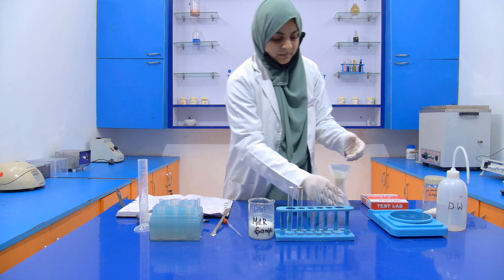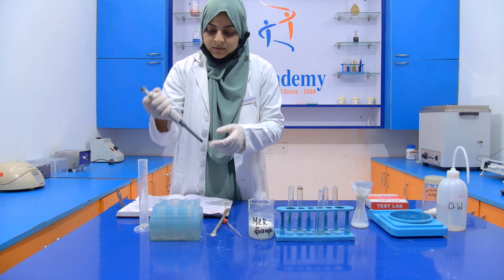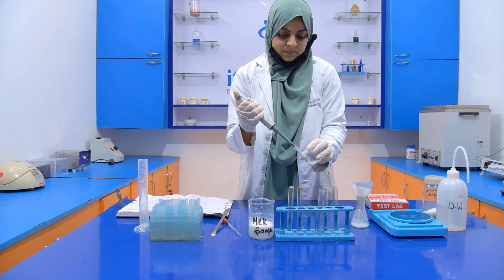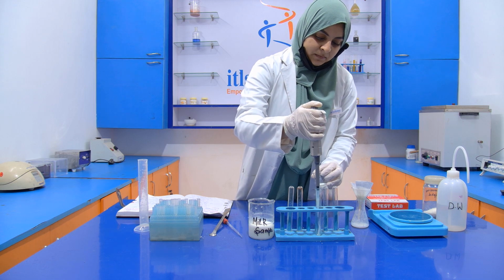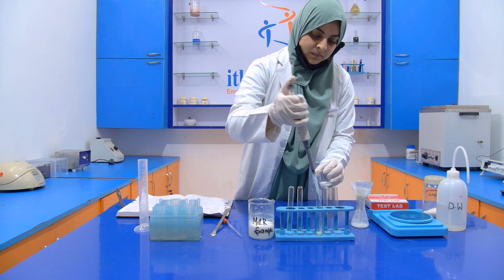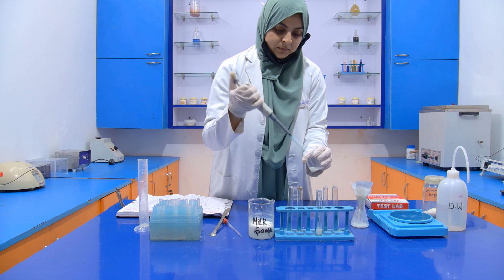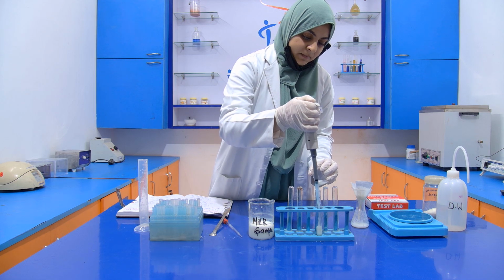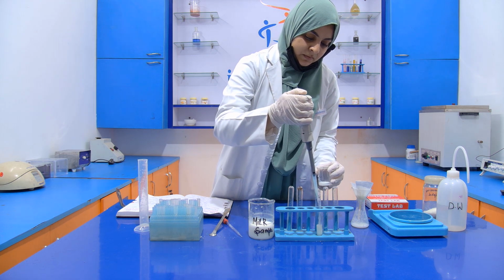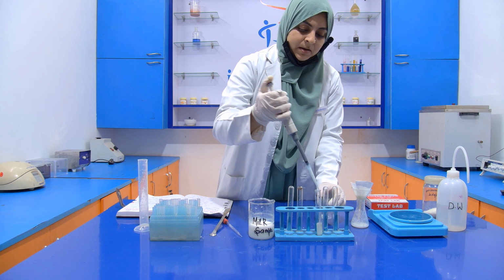Now take a weight. We take it with the help of this, 5 ml. 1, 2, 3, 4, and this is 5.